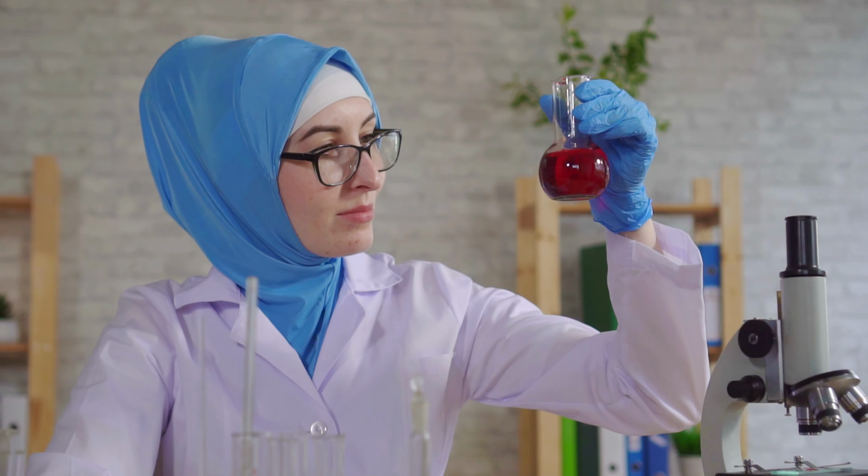That original mixture of soil and water will have had some particles in it that are too small to see with the naked eye, but they have made it through the pores in the filter paper, giving this a slightly cloudy look to it. Now also, those pores are far too large to prevent bacteria or dissolved substances from getting through, and my original mixture will certainly have had some of those in it, and so I certainly wouldn't be drinking this water. And this brings us on to the next important point about filtration: pore size.